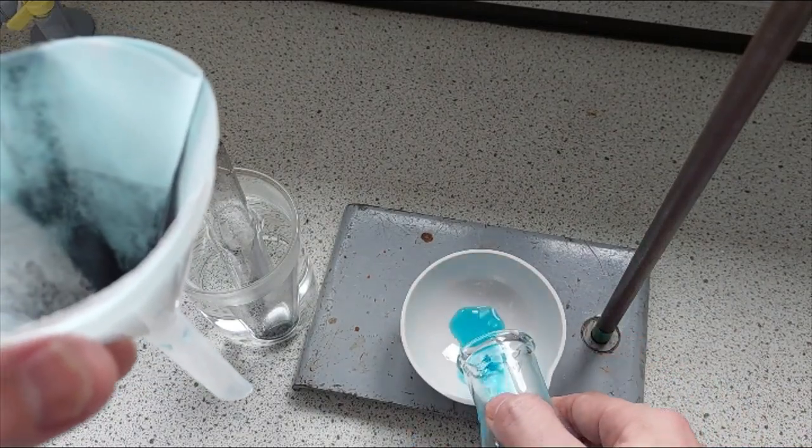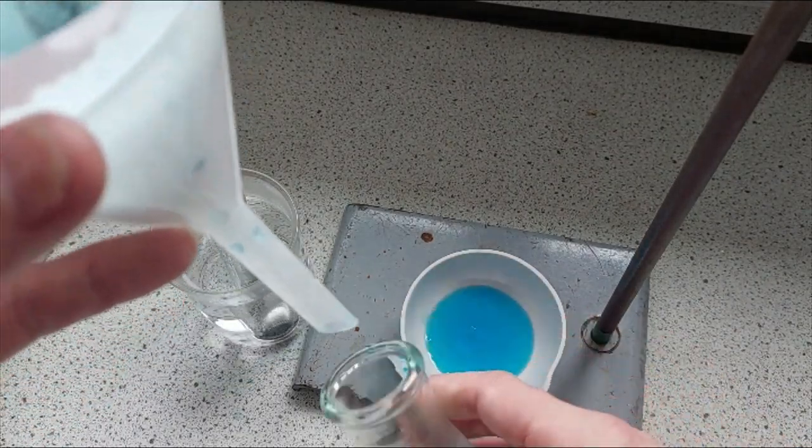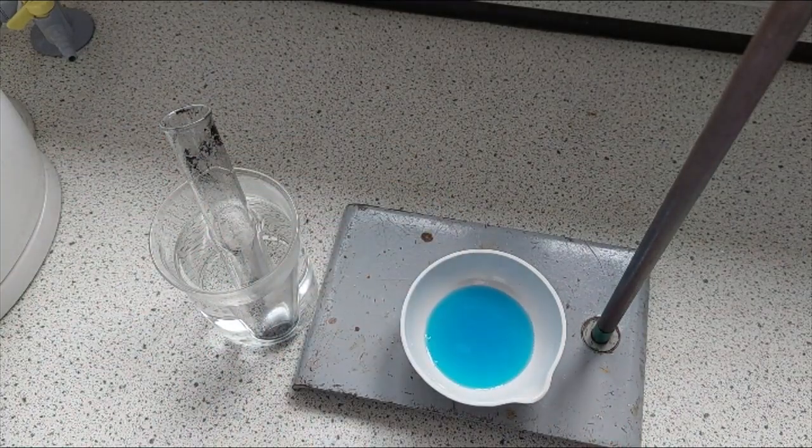Now when doing crystallization, it's best to heat it for a bit until it begins to evaporate, and then after a short while remove the heat and place it somewhere in the room, usually a windowsill out of the way, to allow the crystals to form. Now what we're really trying to do here is remove off as much of the liquid as possible, and that means that the solution becomes what we call saturated.